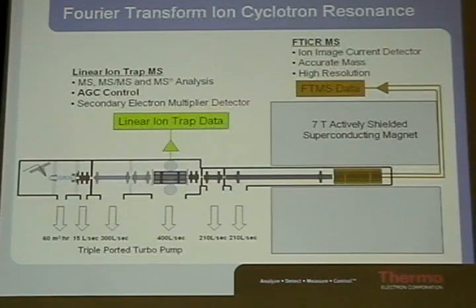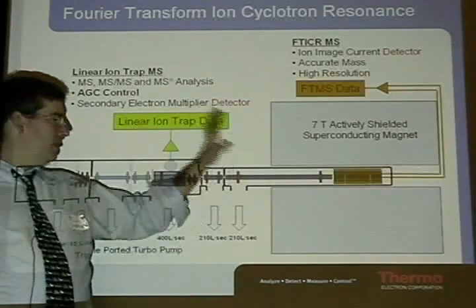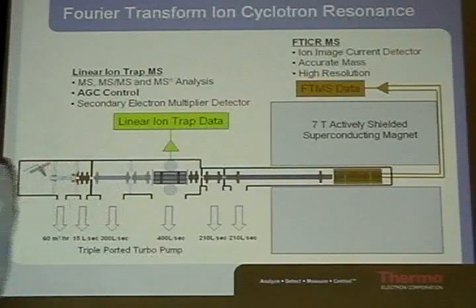And it's got a third calibration for 50 to about 850 scanning. So there's 3 different calibrations because each calibration is set up for different mass biasing, and that's dependent upon what your first mass is. Now, this seems like, why are you telling me this? Because it's very important if you ever do MSMS on the back end.